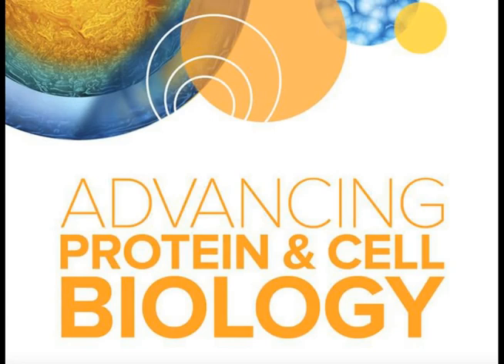Yeah, so that answers that question. There's another question about whether you can image spheroids over time in the system. Yes, sure. We have done these studies. We actually monitor formation of spheroids and the acute effect of some drugs. So you can do it by using time lapse. You set up, maybe 20-minute intervals, or do an overnight experiment, and you can monitor formation of spheroids in real time.